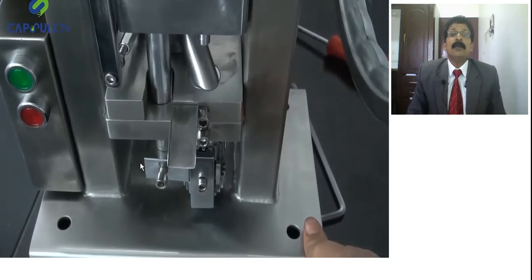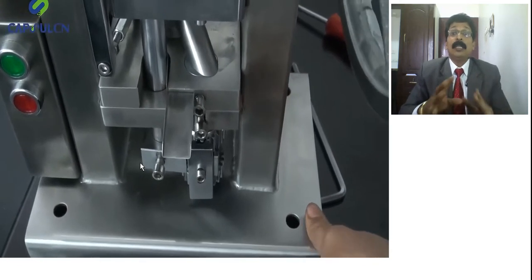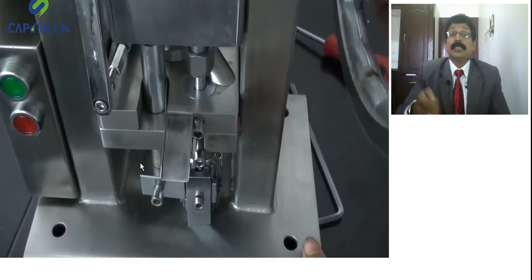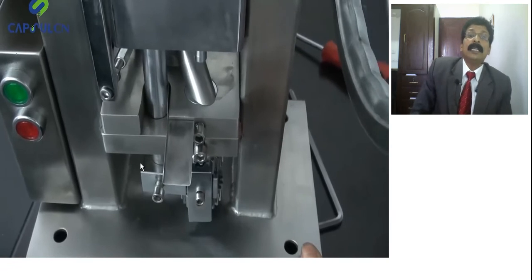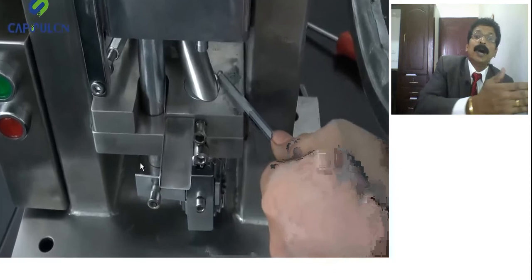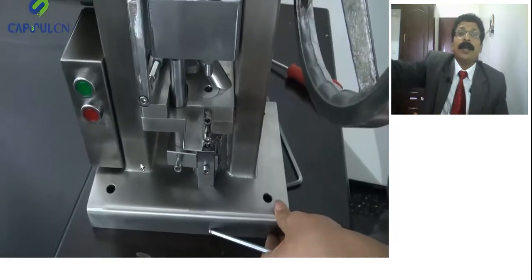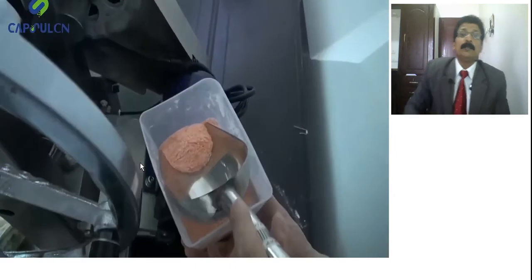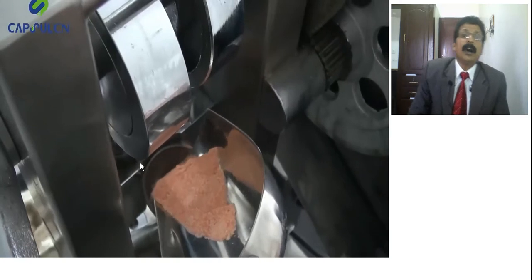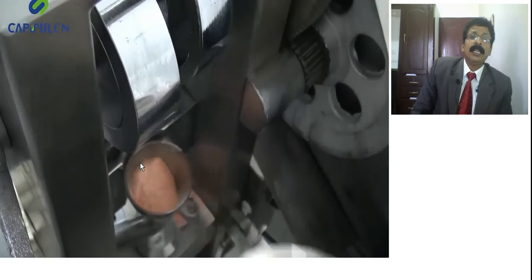It's not completed yet. You still have to check whether the tablet is coming out with the proper hardness, thickness, everything, one by one. Now you are seeing how the hopper works, and how it comes and wipes away the compressed tablet, and then he fills it again with the powder or granules. You can fill it in the hopper. Can you see the hopper which holds this powder? And he is filling that.